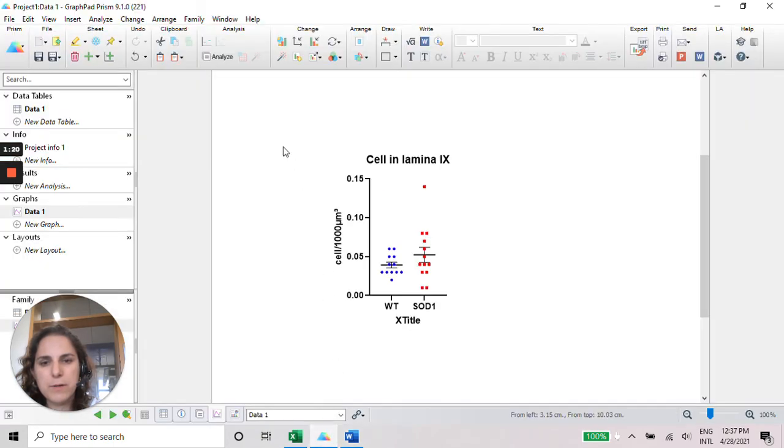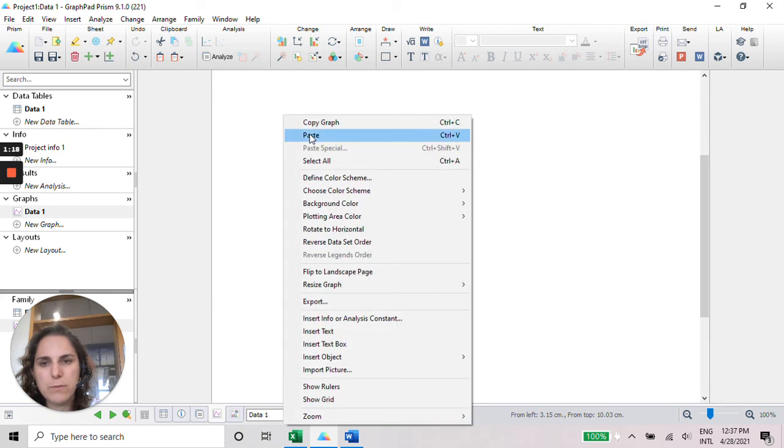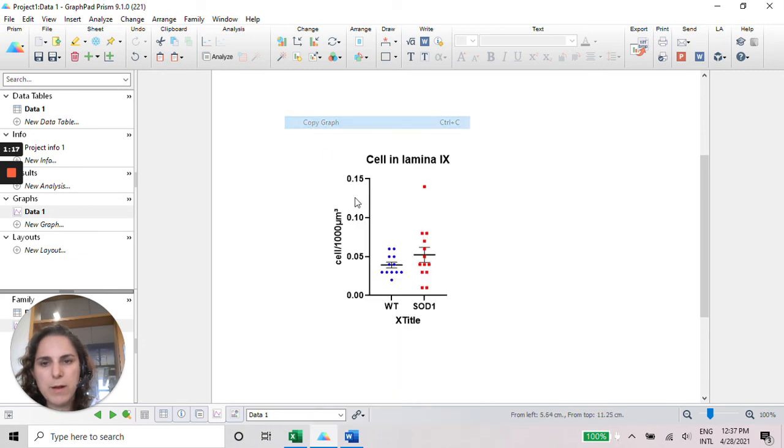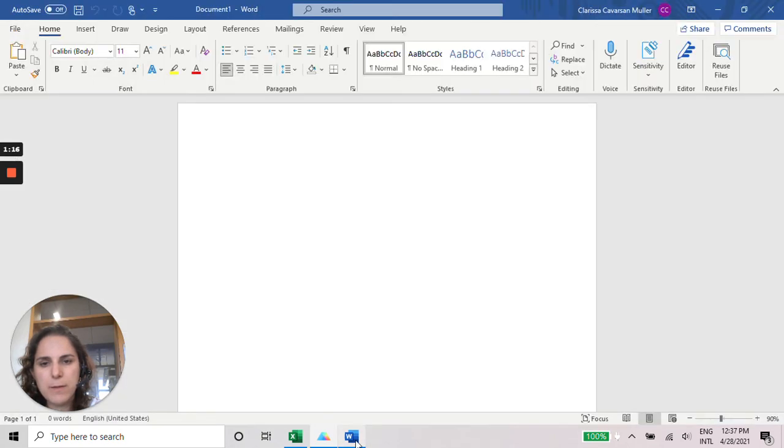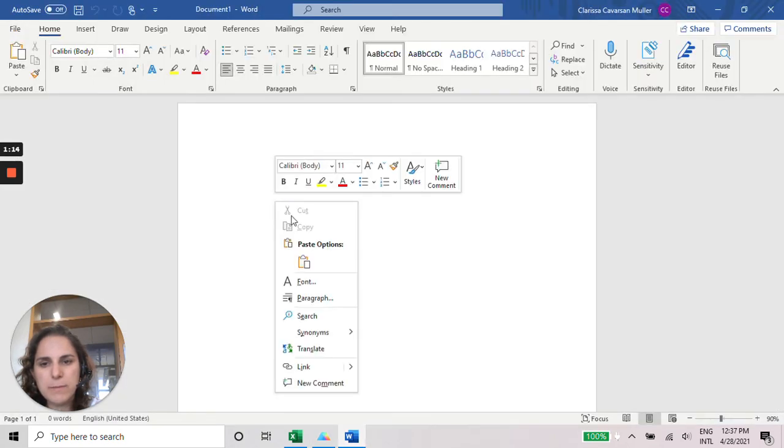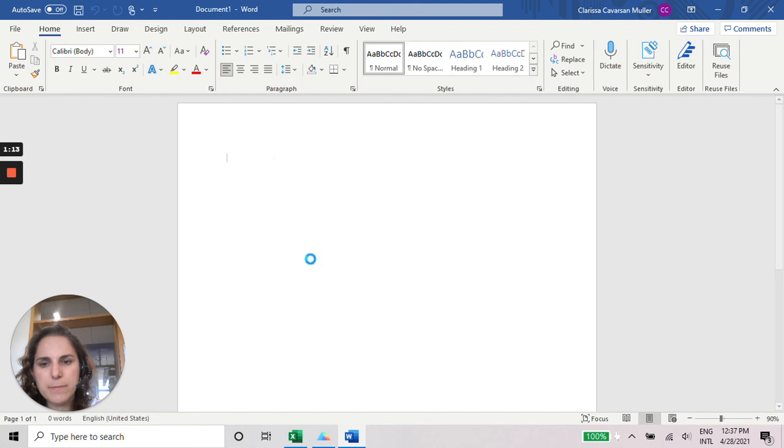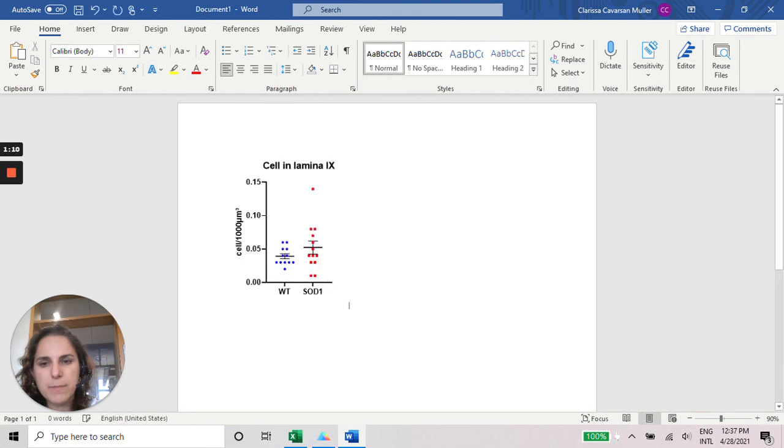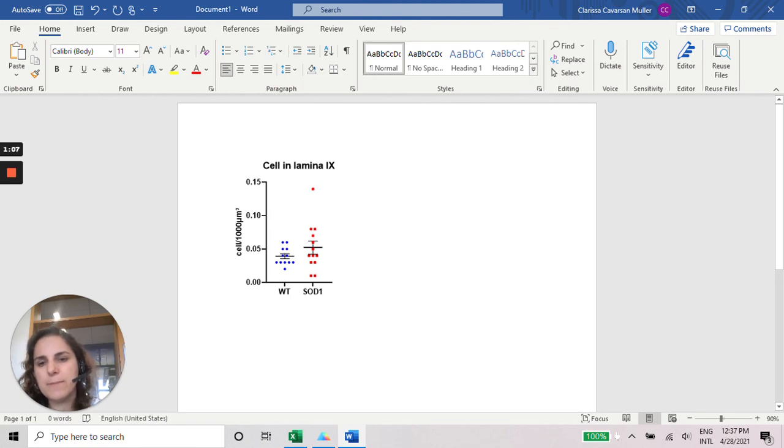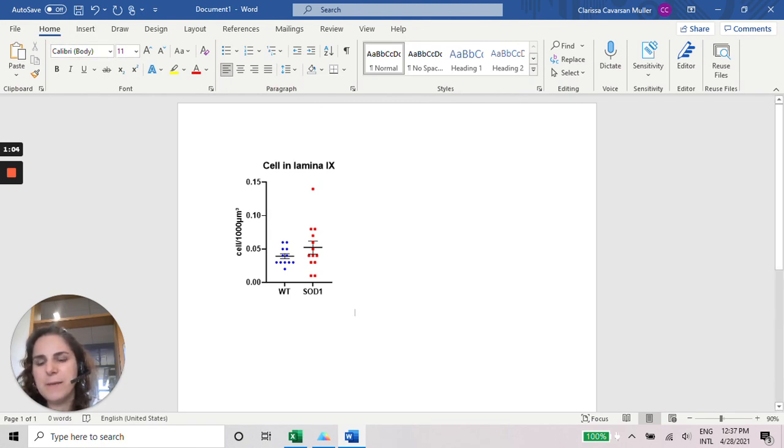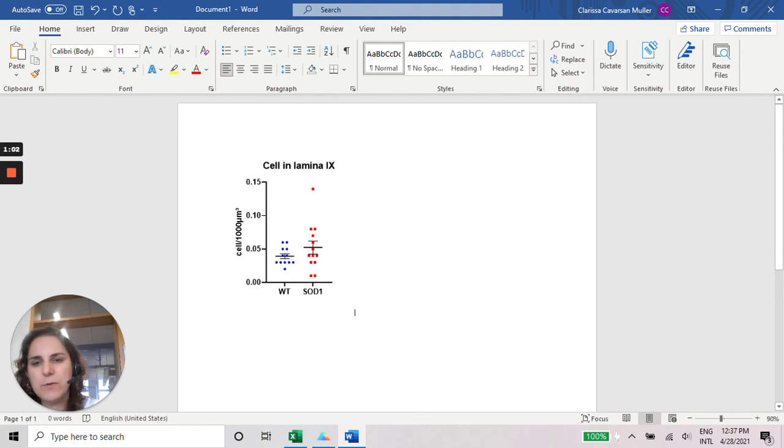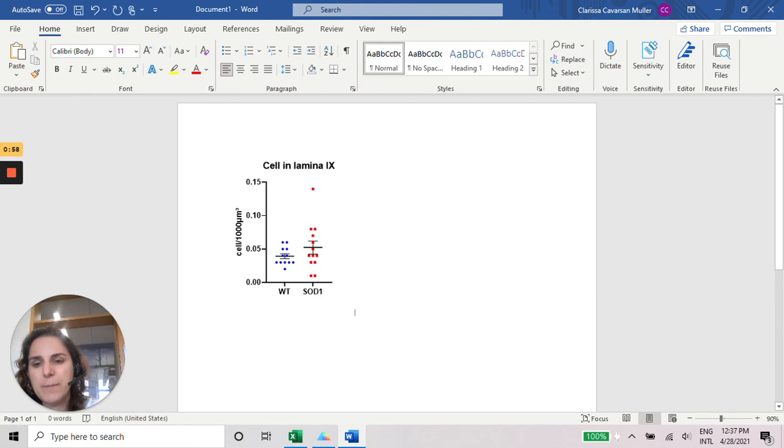So if you return here, we do a CTRL-C, copy graphic. And paste. And here is our graphic. Done. Good. Very easy. With good layout. And very clean. I really like this type of graphic. That's it.